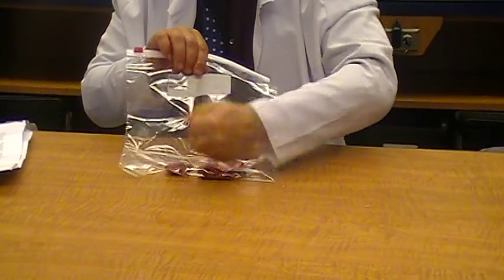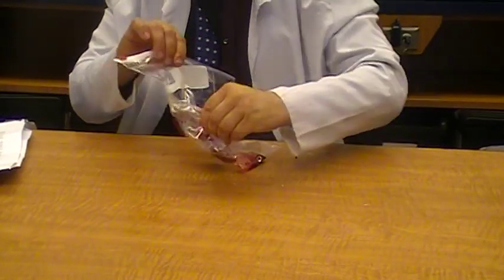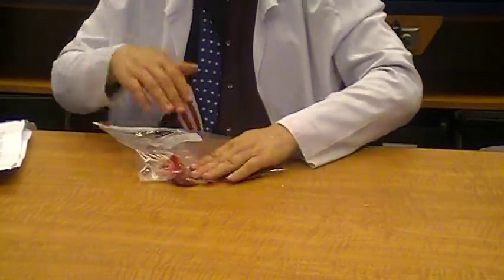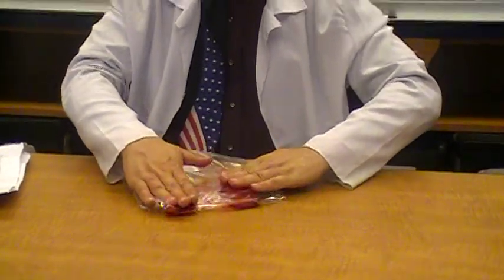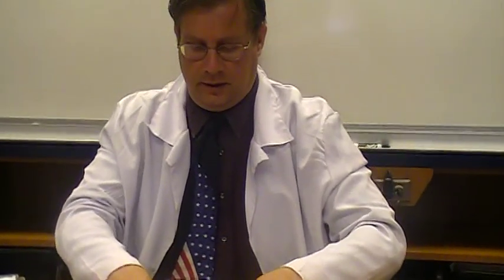I'm going to pound and squeeze all the strawberry guts out of these strawberries. Now, while I'm doing this, let me just give you a couple of facts about DNA to entertain you while I'm squeezing out all these guts. Did you know that the average strawberry cell contains about nine feet of DNA?